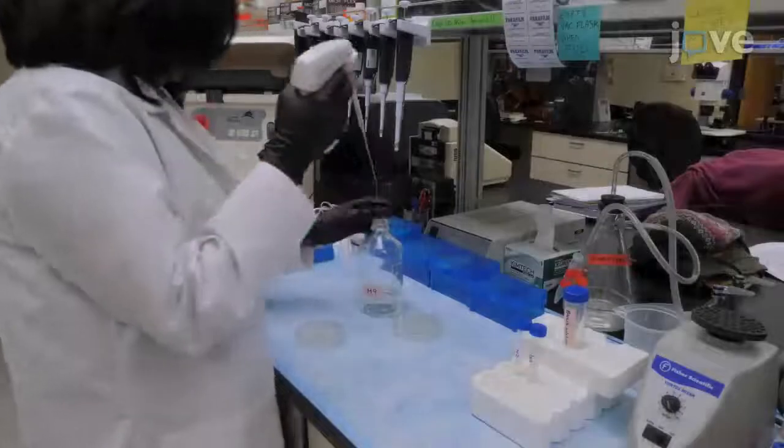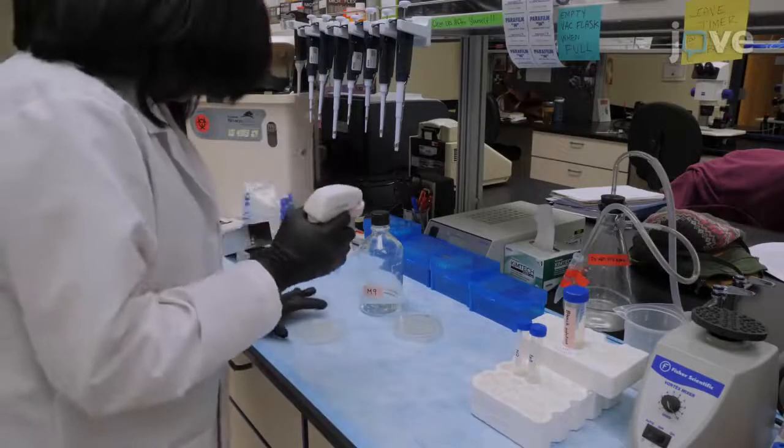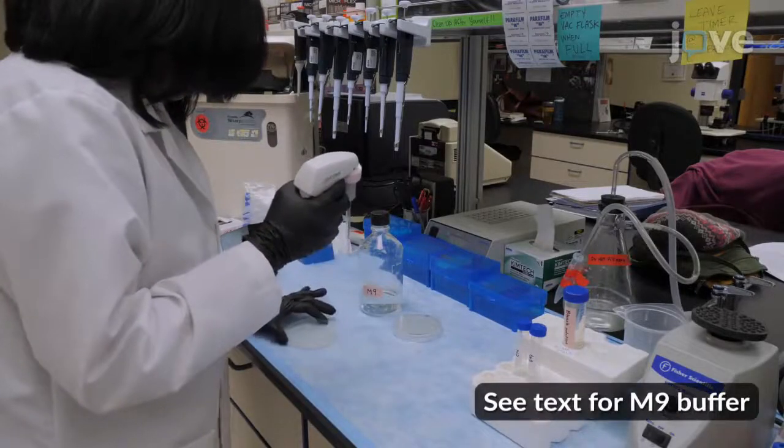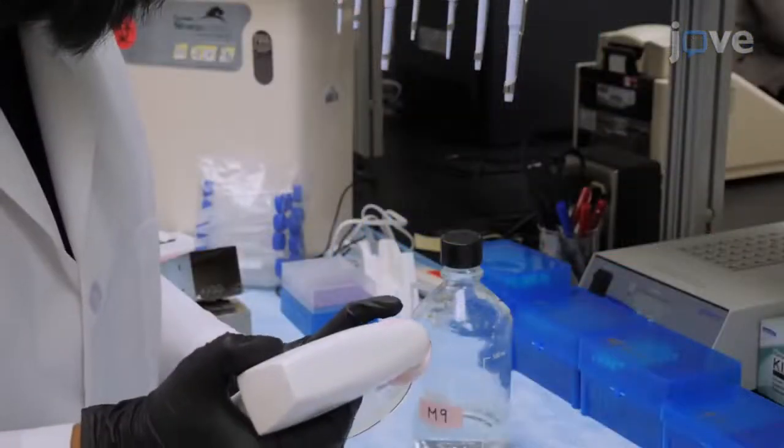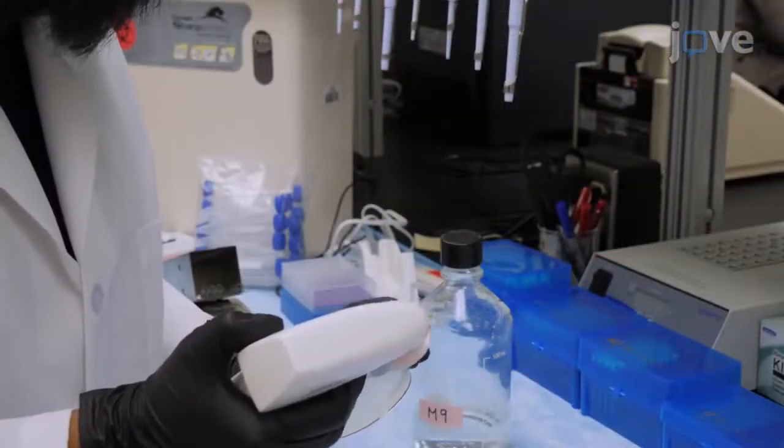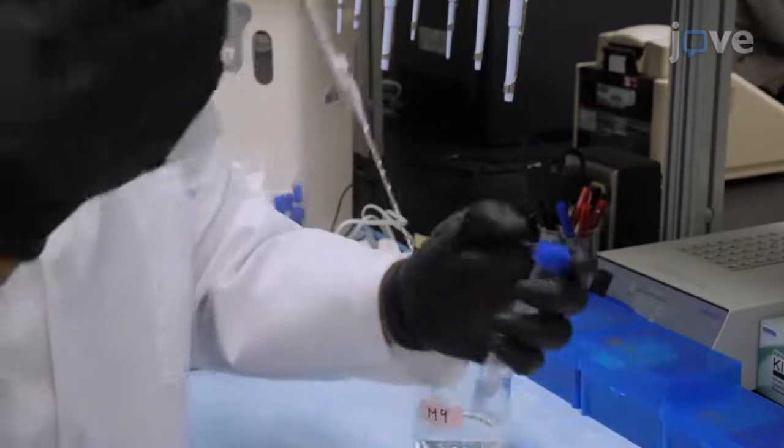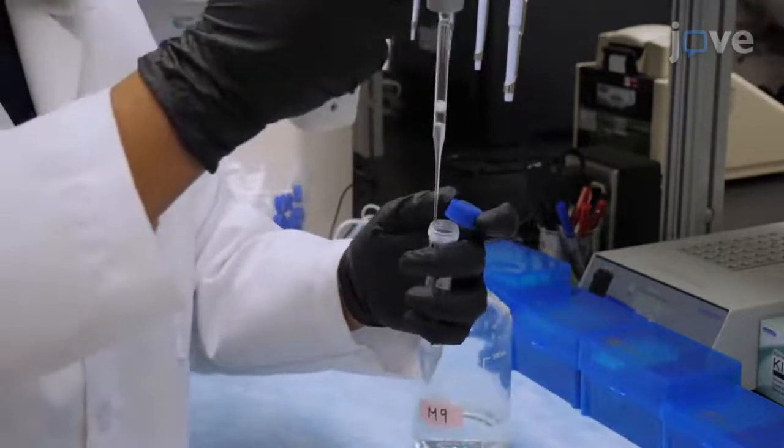Wash the eggs and worms off the plates using approximately six milliliters of M9 buffer per 100 millimeter plate of nematodes. Using glass pasteur pipettes, transfer the eggs and worms into individual 15 milliliter centrifuge tubes for each strain.